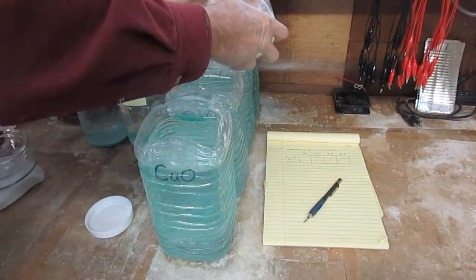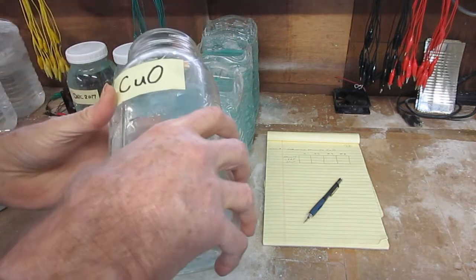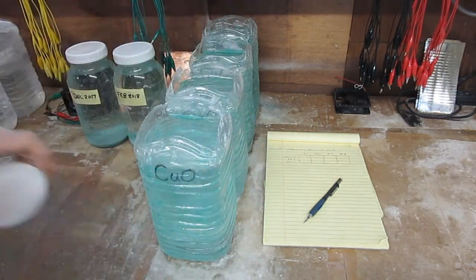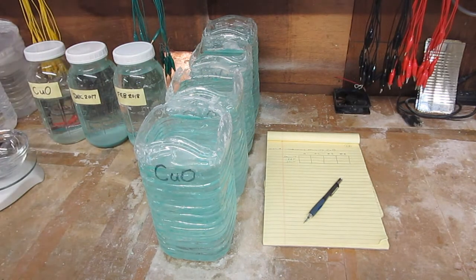First, I will top off each container so I have a known volume of water. Each of these containers holds 3,350 milliliters. Next, I will measure the salinity and then calculate the amount of salt that is dissolved in the solution. Then I will calculate how much salt I need to add to raise the salinity to the desired level.